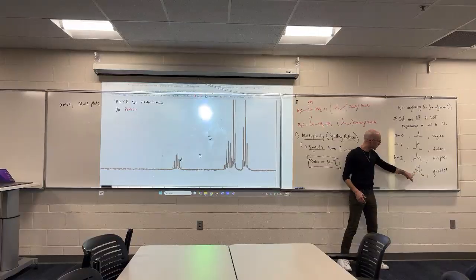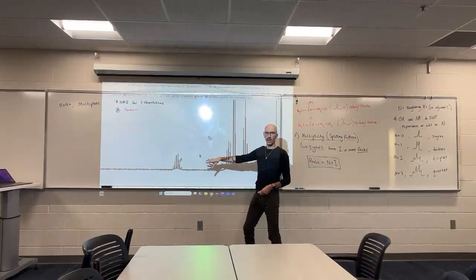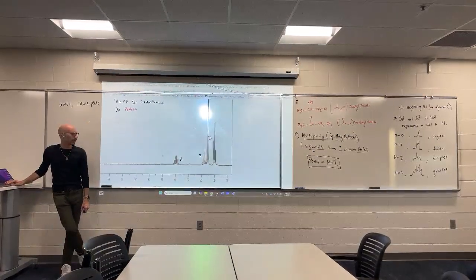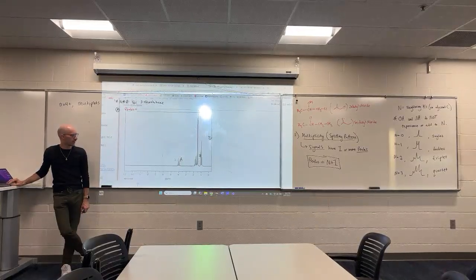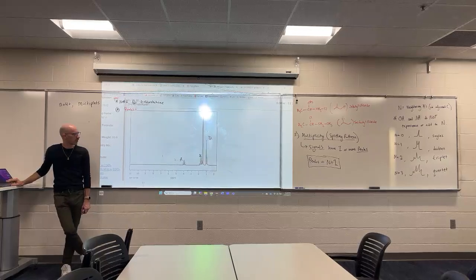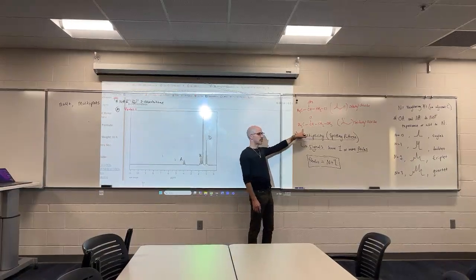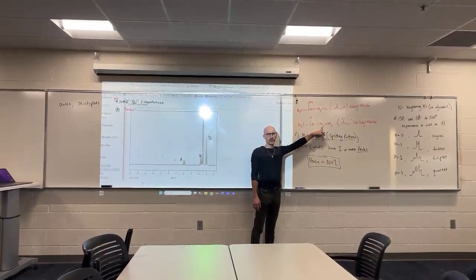Because 4 peaks has 3 neighbors. But 3 neighbors, and remember that A is a 1H group. 3 neighbors would be just a CH3. And we know that our, boy, I really screwed it up. We know that our 1H should have a CH3 group and a CH2 group next to it.